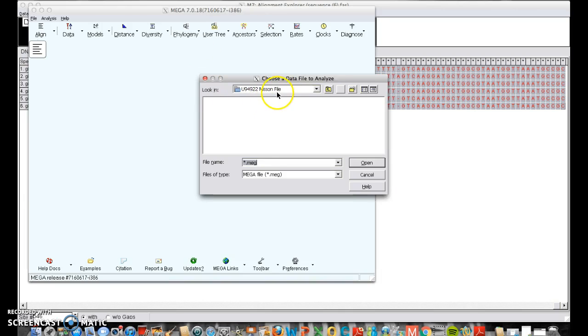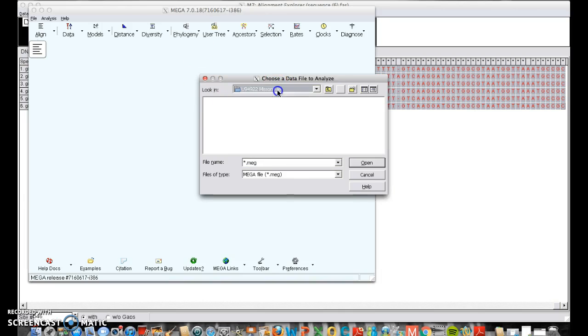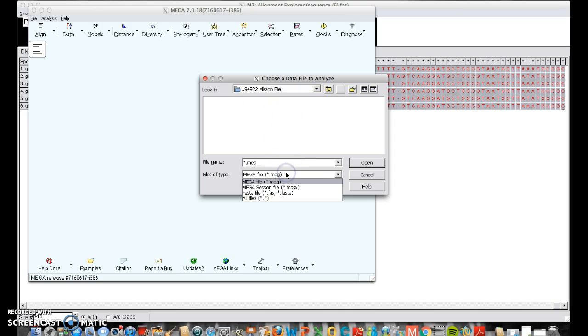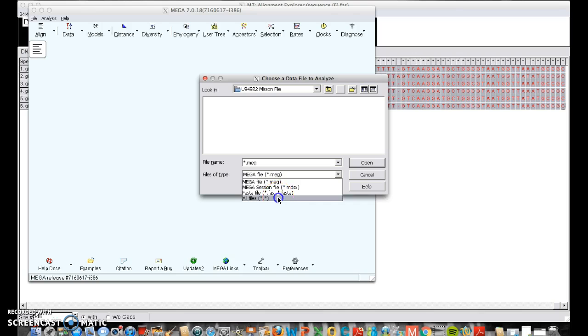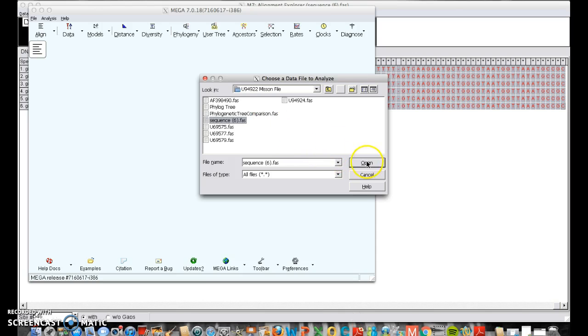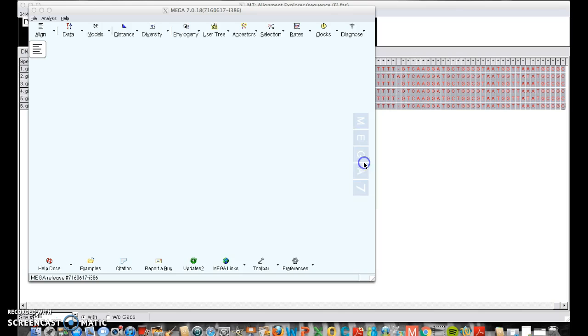We're going to construct a neighbor joining tree today. And it wants to know what file we want. So I'm in the right folder for me, but I can't find my file. So I'm going to choose all files again. Remember, if you can't see it, try that. And I just had it saved as sequence 6. Excuse me. Please make sure you know what yours is saved as.